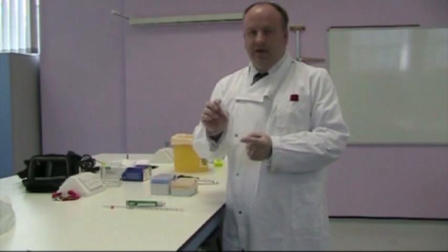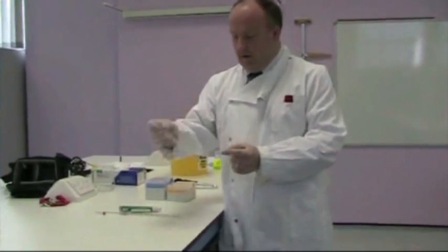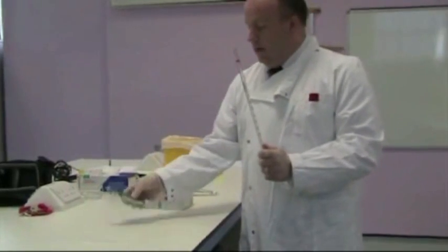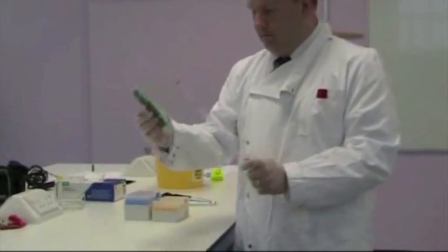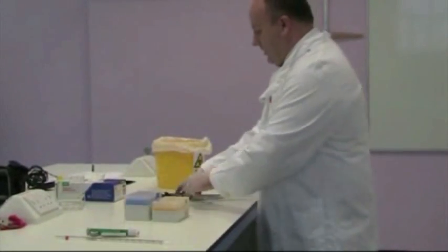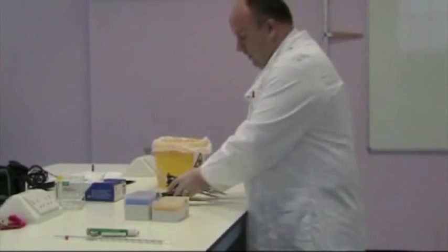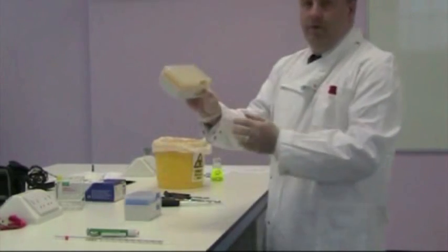So the first one is a plastic pasteur or bulb pipette. The second one is a graduated pipette and a pie pump. And then the third type are micropipettes which come with separate pipette tips.